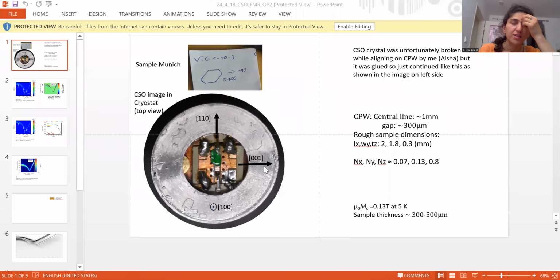So in the end, sometimes it's very difficult if you want to discuss your results and ideas with your group members, your colleagues, by very long detailed sheets. So it's important to keep them safe, keep all information, but you can then extract some information and put it already in a PowerPoint. And like pictures which are important, some description which is important.